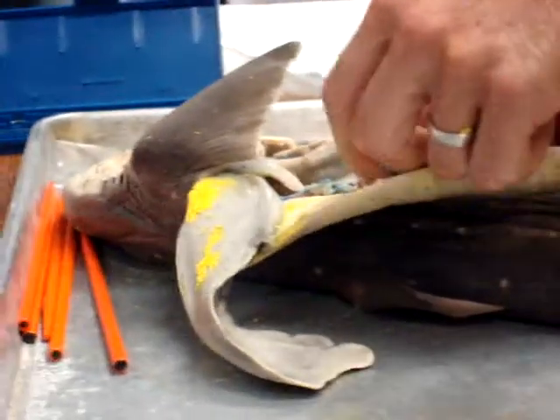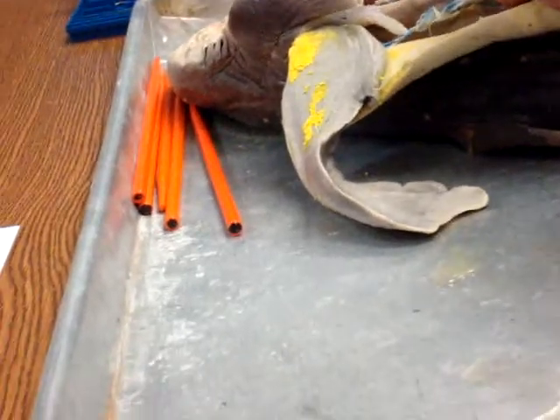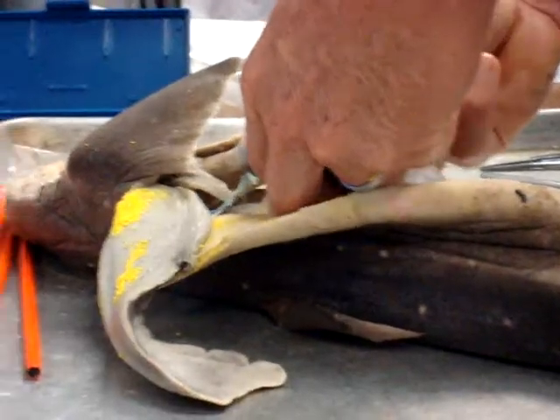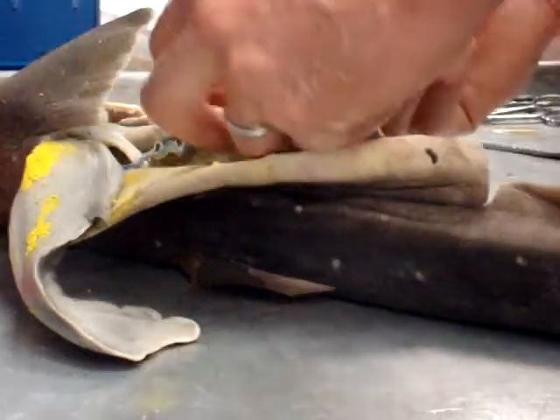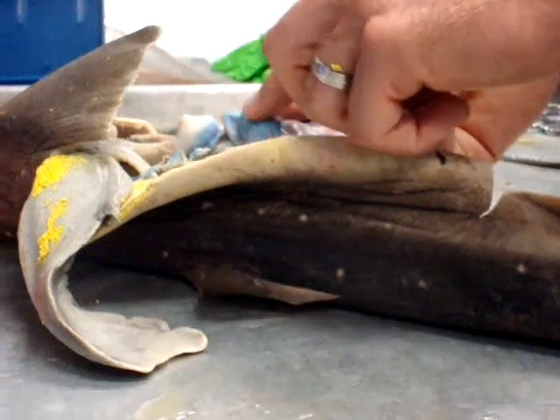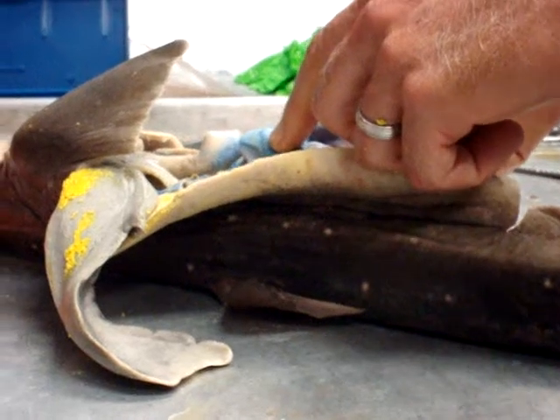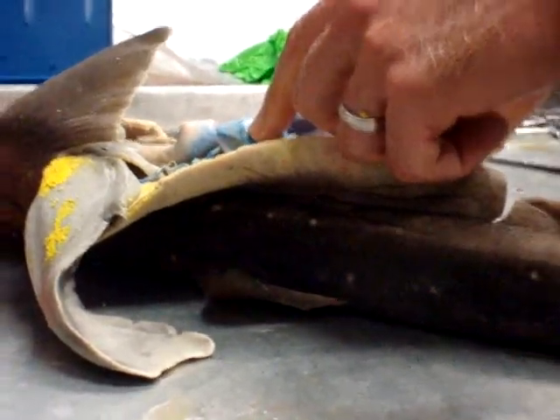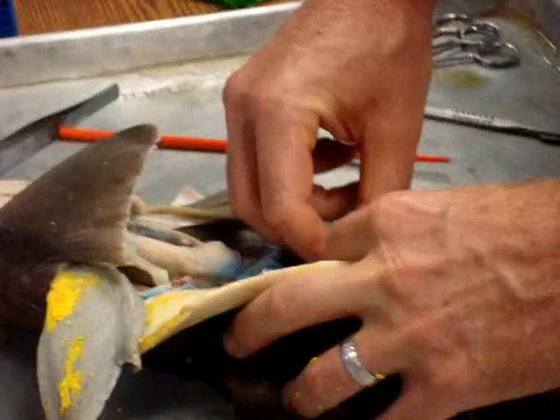Can we go back up to the pancreas real quick? Our shark is mutated. I'm sorry. You're witnessing lower stomach. The pancreas is located on the duodenum and the lower stomach. And the pancreas is... I thought that'd be that guy. How about this guy? Pancreas. I totally apologize. Can I revert? So pancreas. Right below the esophagus slash stomach, that's the pancreas. Right, the one that you're pointing at right there is the pancreas. The triangular dark one is the spleen below it. Yes, that's the pancreas. I totally apologize.